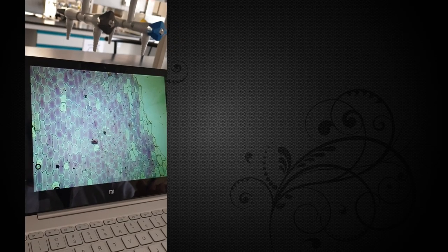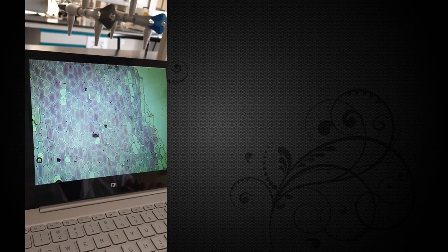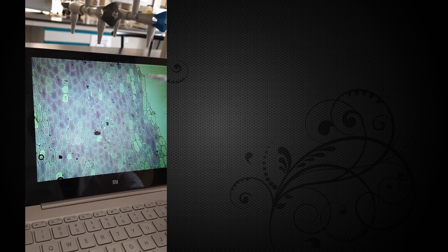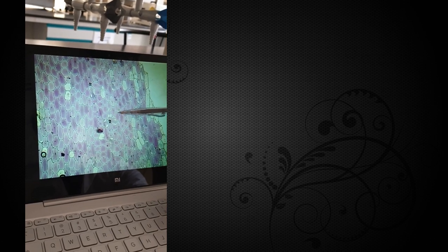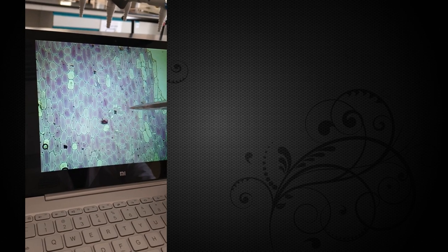So here we are. We have our slide of nice pink onion cells. And so what you can see here is that the cells are completely filling the actual space that's available to them. Let's switch over to higher magnification. Just focus a little bit.